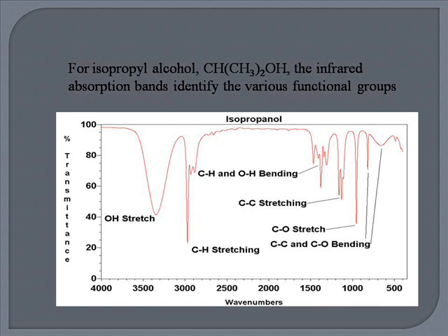A single background measurement can be used for many sample measurements because the spectrum is a characteristic of the instrument itself. So, the detected signal is digitized and further transformed by the computer to get the IR spectrum of the sample gas. The resulting spectrum is the characteristic of the organic molecules present in the sample. So, we can know the compounds present in the unknown sample. So, this is how an FTIR works.